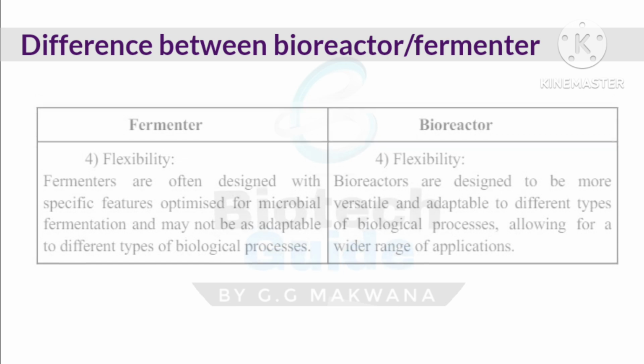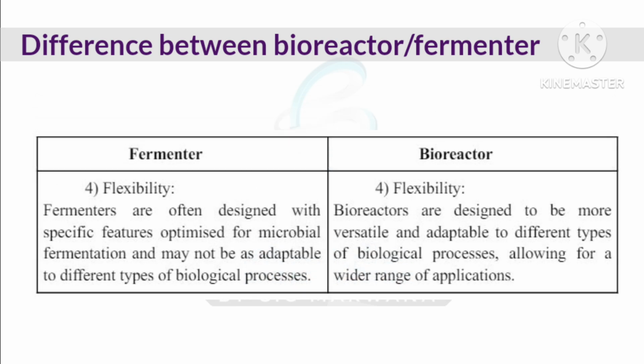Then fourth, flexibility. Fermenters are often designed with specific features optimized for microbial fermentation and may not be as adaptable to different types of biological processes. Whereas bioreactors are designed to be more versatile and adaptable to different types of biological processes, allowing for a wider range of applications. That means fermenters have specific features for specific microbial fermentation processes, whereas bioreactors are more versatile and have a wider range of applications.